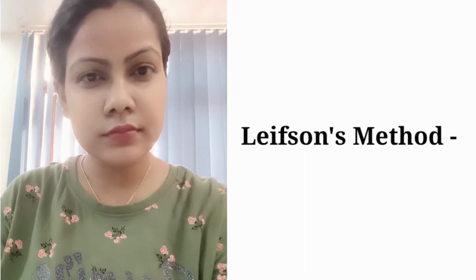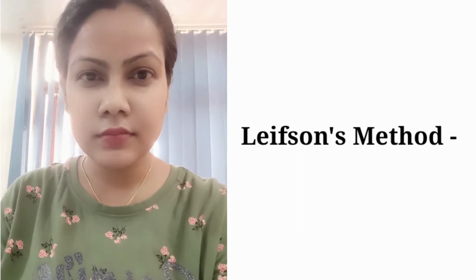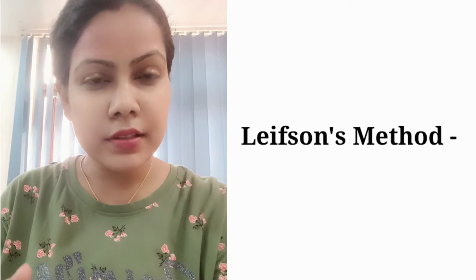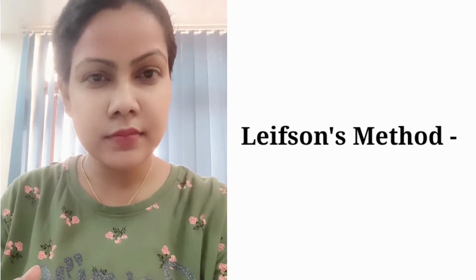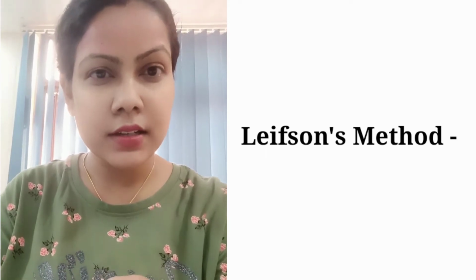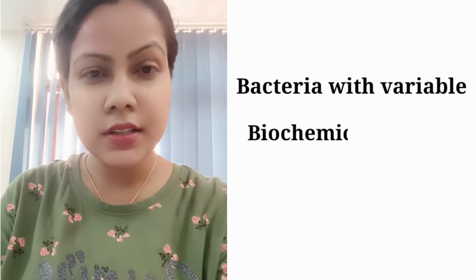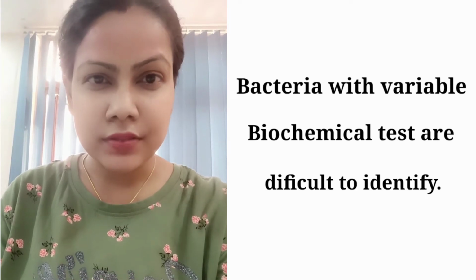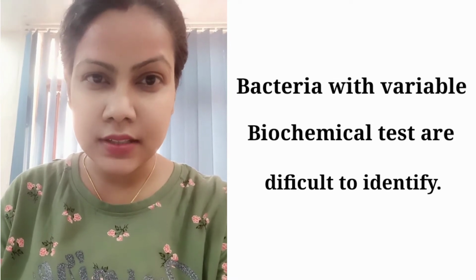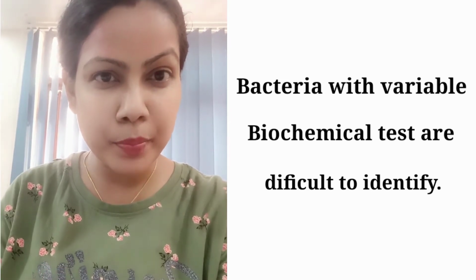So, at first, why do we need detection of flagella? Because there are some pathogenic bacteria which possess flagella, and they give their biochemical test results in a variable fashion. So their detection through biochemical methods is difficult. So we go for flagellar detection to make a proper diagnosis.